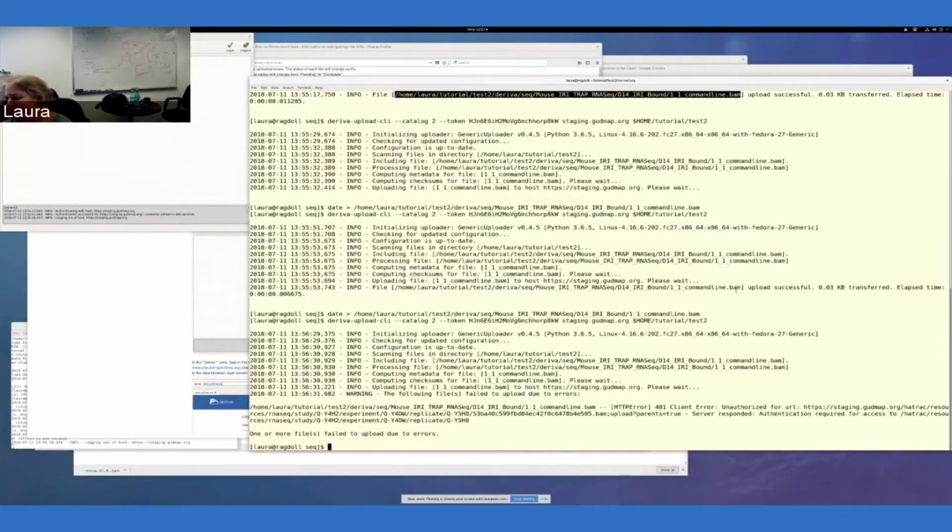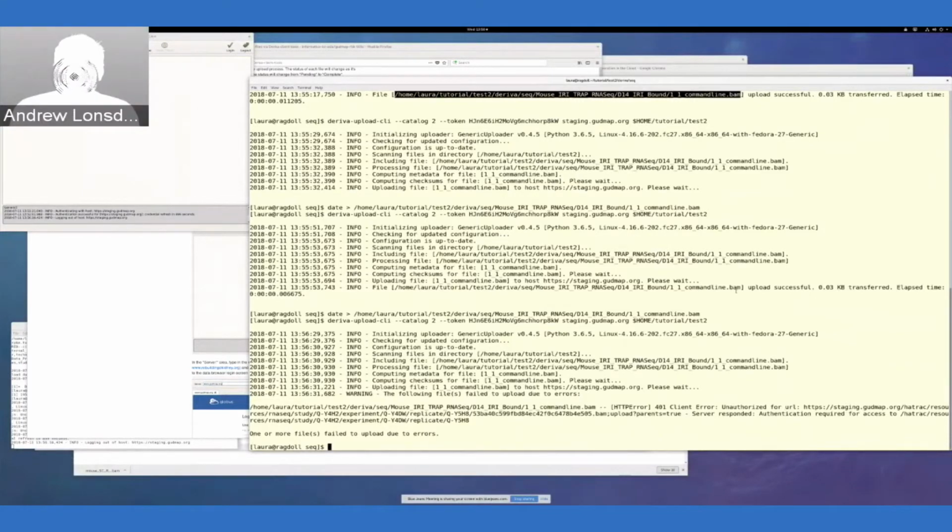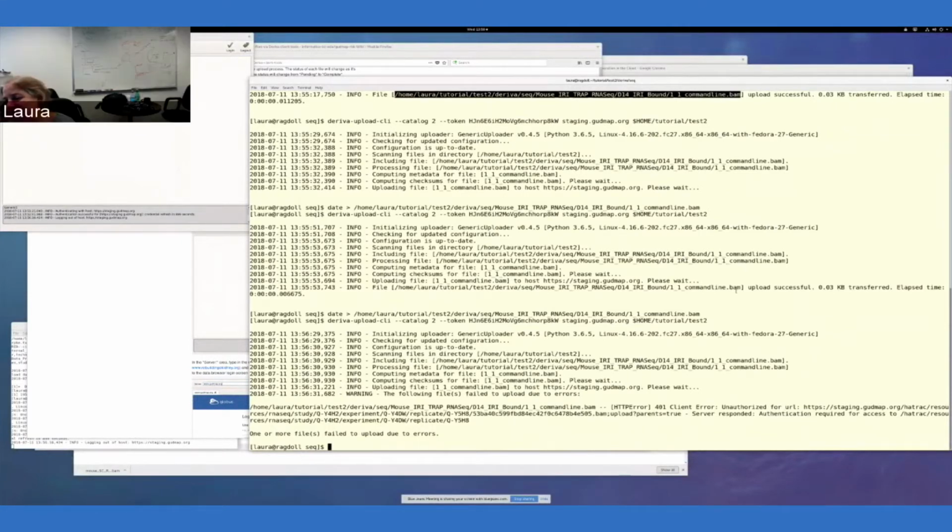It'll basically indicate that the system has no idea what to do with these files, so it's skipping them. Okay, thanks. But if you create the records and run it again, it should work. But it will not upload any files if it's not able to determine a destination record for them.